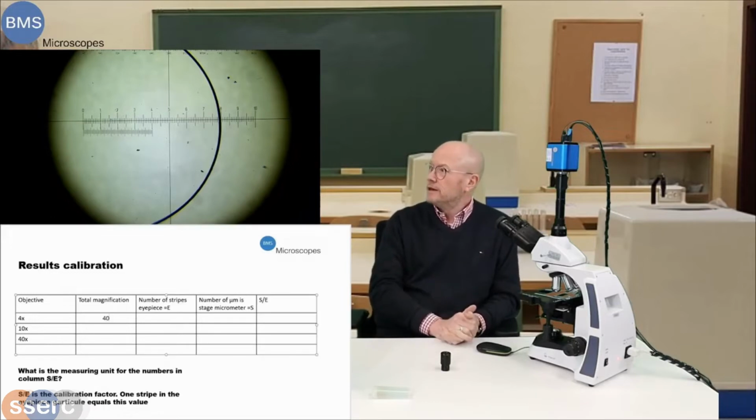So we see there the 4 times objective is on. Total magnification was 4 times 10, 40. The number of stripes in the eyepiece is 20. And the number of micrometers that we have measured in line with the 20 is 500 microns.